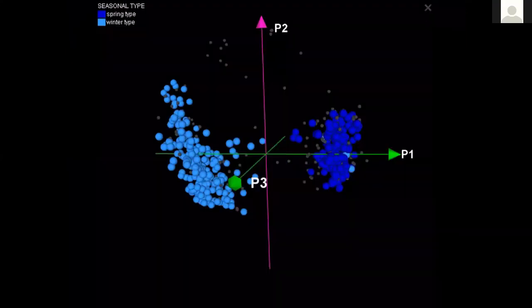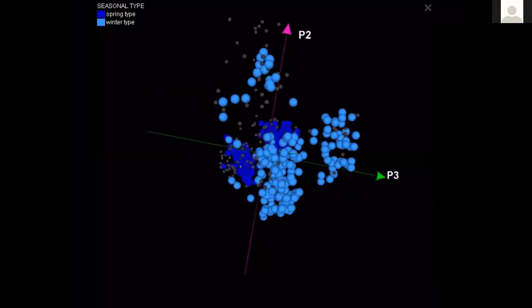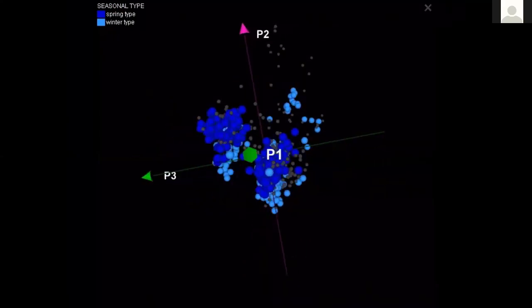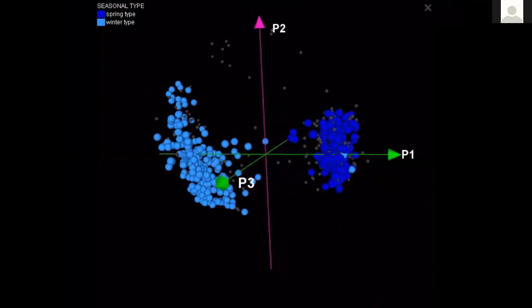Being in 3D, the easiest way to try and show this, I have no idea how well that's going to work over the Zoom. I'm just looking back at Gordon's screen, which is connected to it. It looks like it's animating not too bad.